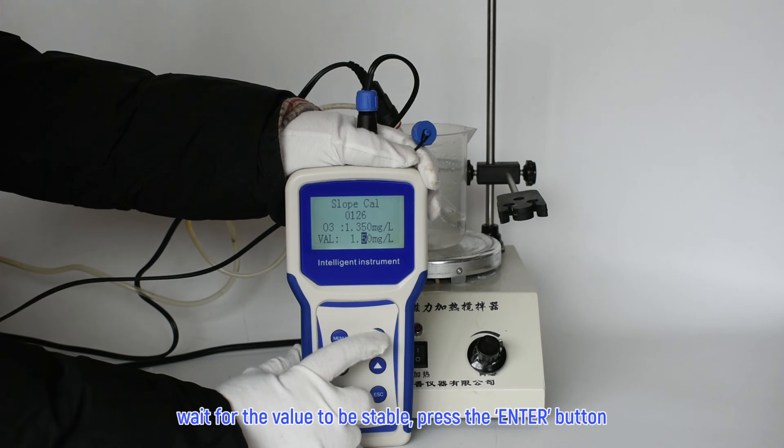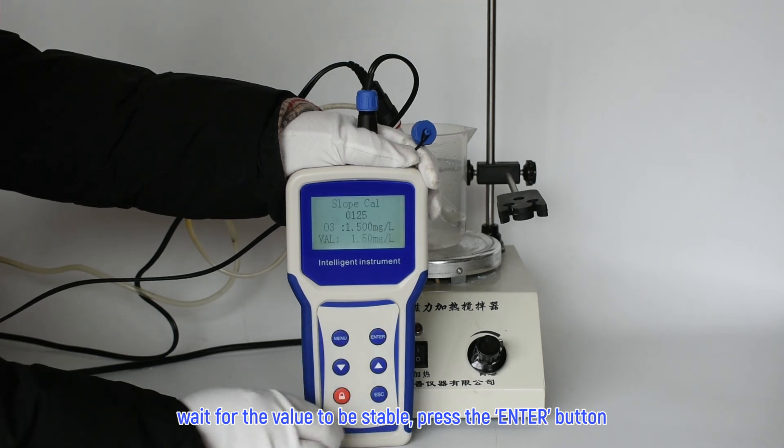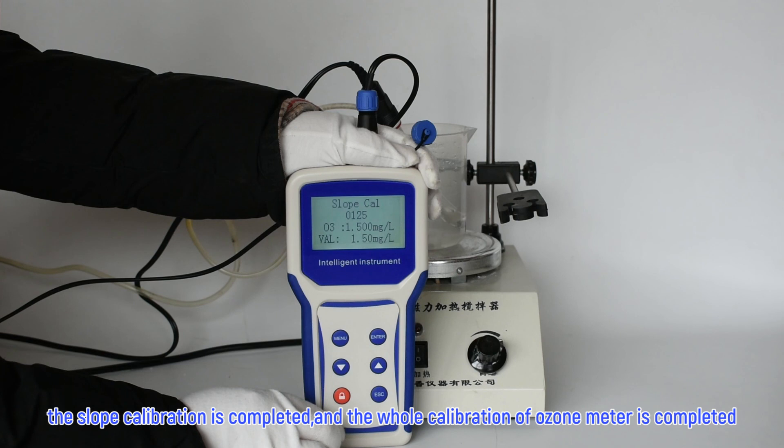Wait for the value to be stable, then press the enter button. The slope calibration is completed, and the whole calibration of the ozone meter is completed.